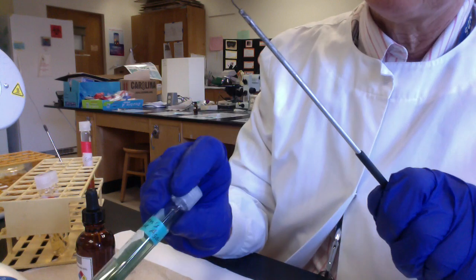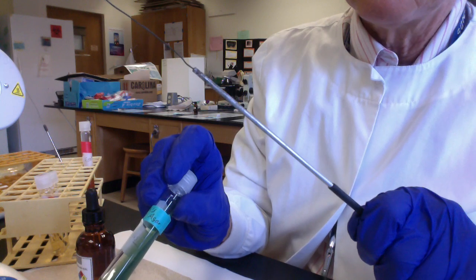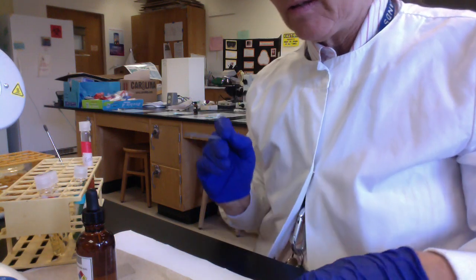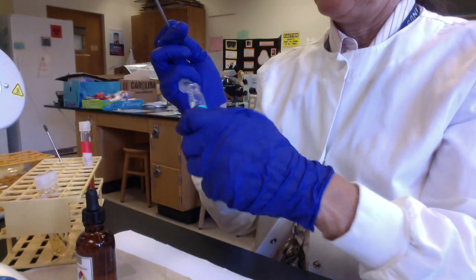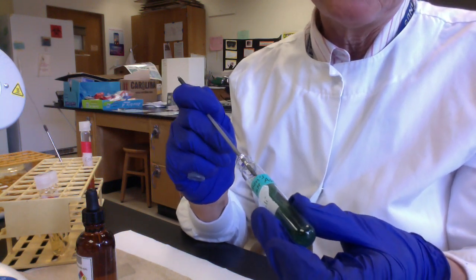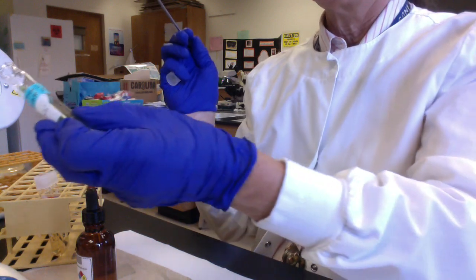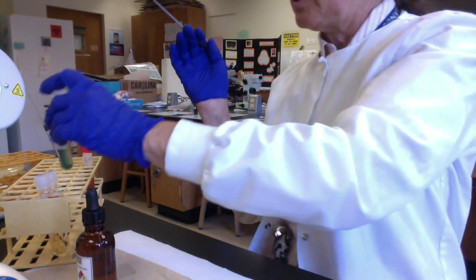So this is a Simmons citrate agar slant, and I'm going to inoculate the surface of the slant. This is a test that's run aerobically. Okay, so again, I'm going to harvest my E. coli. Okay, and then I'm going to inoculate my slant. Okay, start at the bottom and gently let the loop glide over the surface, kind of like in an S shape, like you're a snake slithering up the slant. Okay. And again, with all of these tubes, you guys, we want to make sure the caps are just barely loose so they can vent.